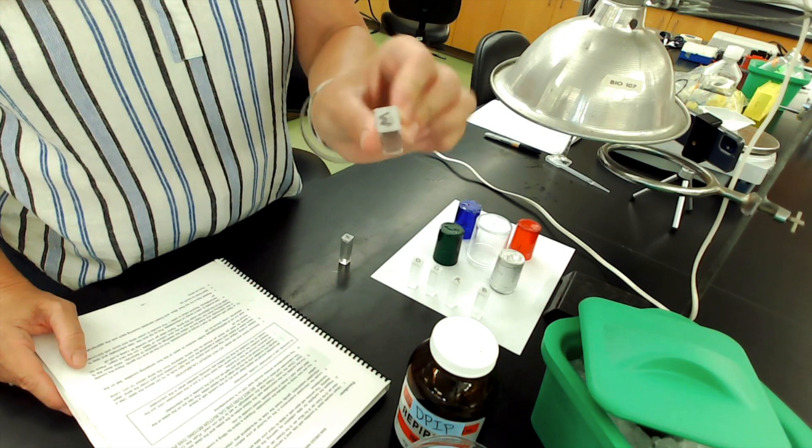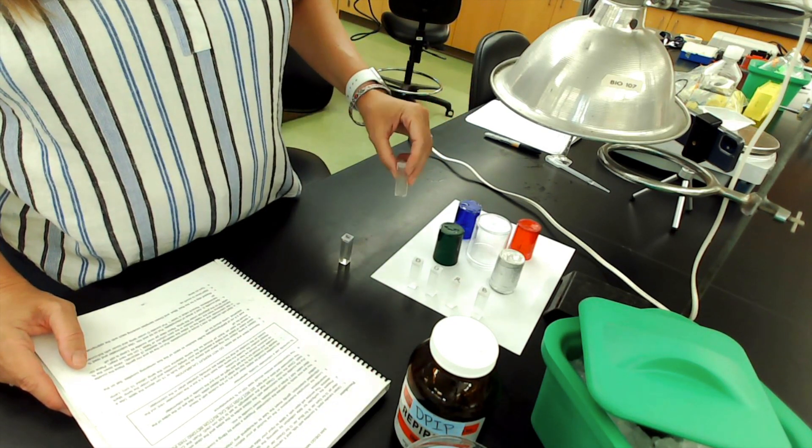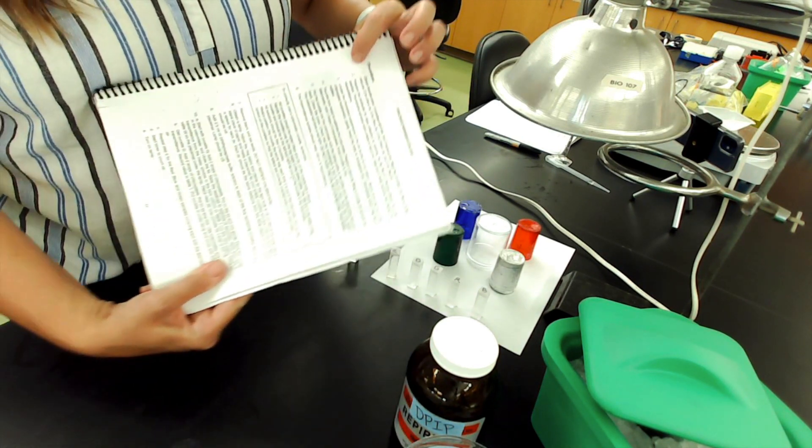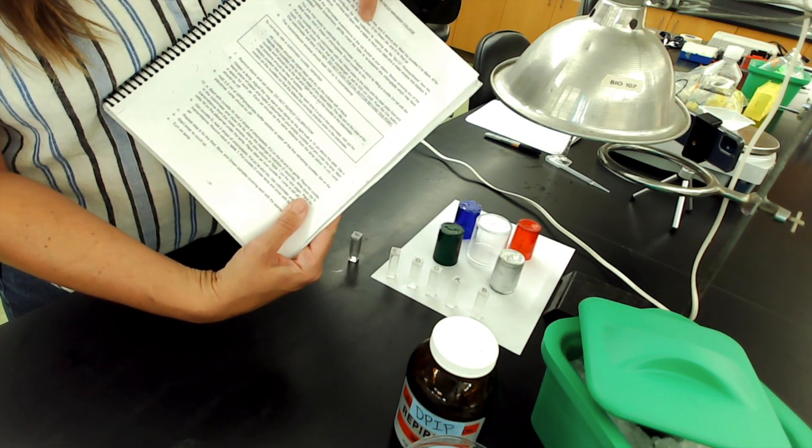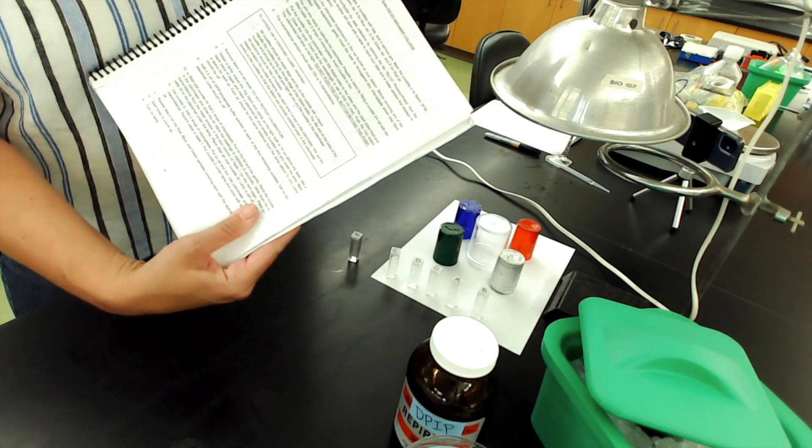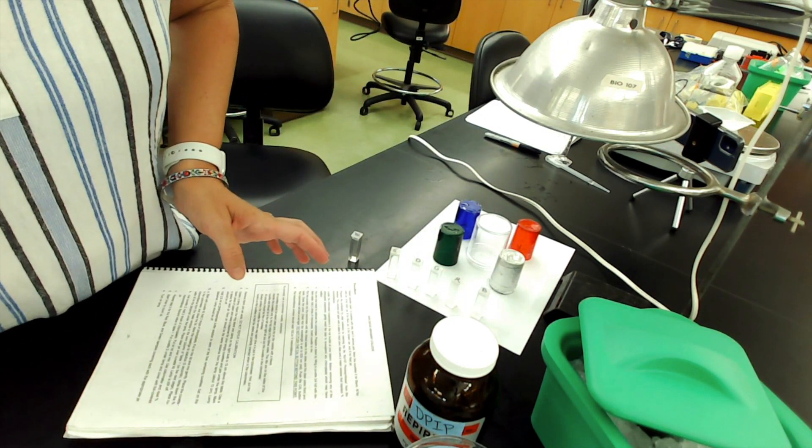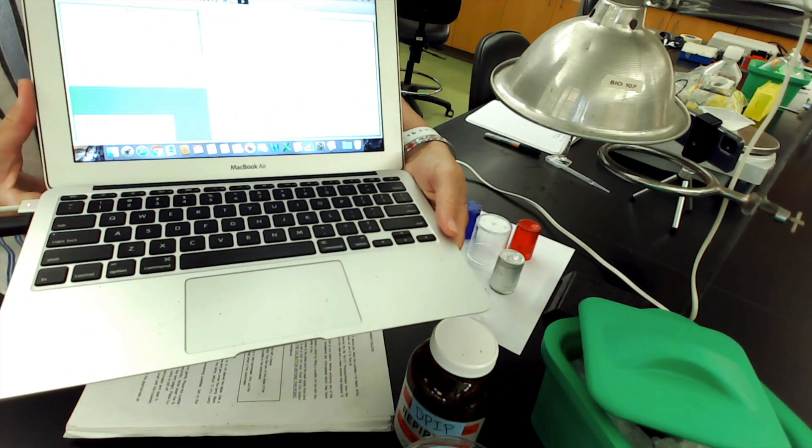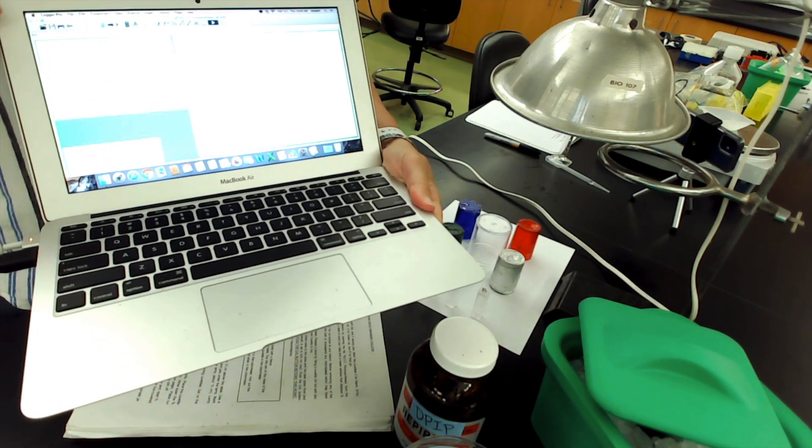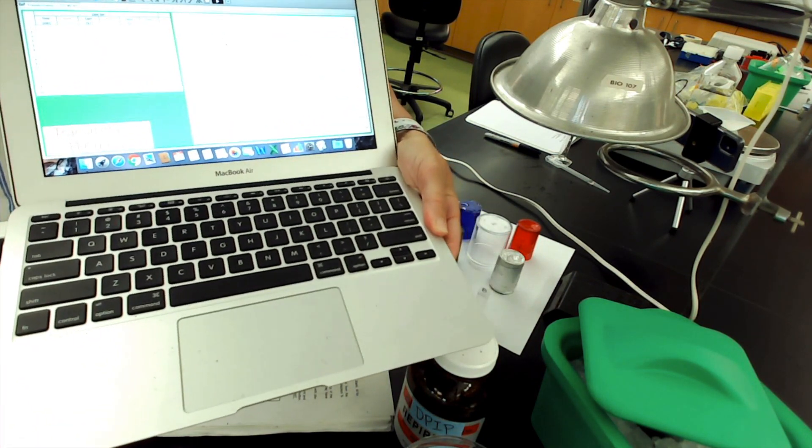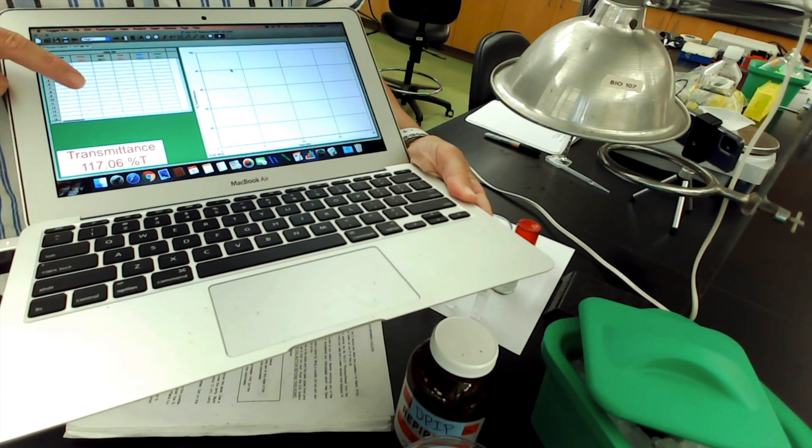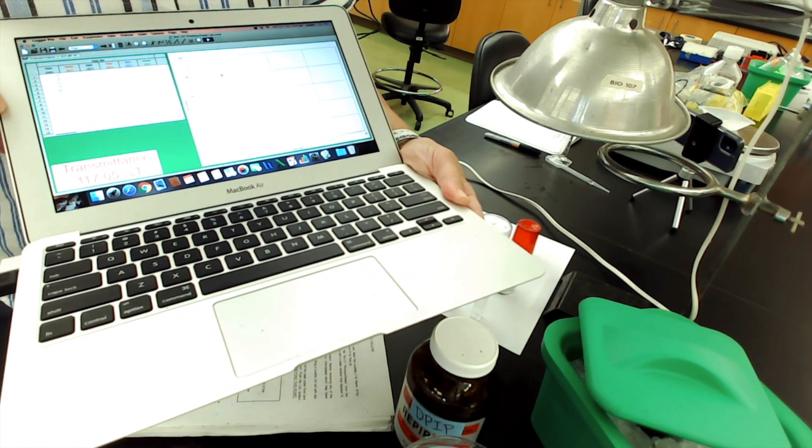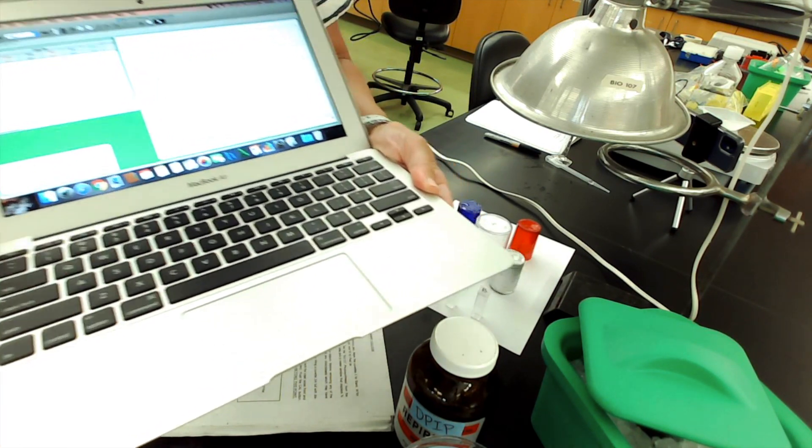These are our cuvettes with lids. If you go to step two on page 59, prepare the computer for data collection. This is pretty similar to what you did in Enzyme Lab, right? You have a computer here, it's our data logger. It's got a table for collection of data that we'll put in and it'll graph that data. So we have a way to keep track of all the data we're going to collect.